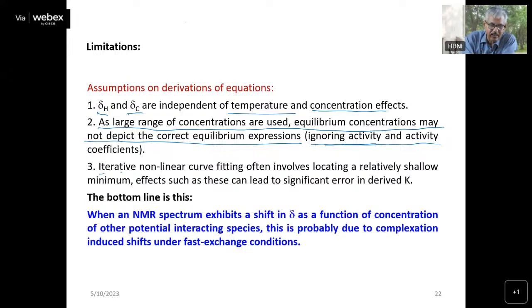And the third thing is that the processing of the data, as iterative non-linear curve fitting, involves location of a relatively shallow minimum. Okay, so that is a problem, and that's why it can give you a significant error in your equilibrium constant value. Okay.